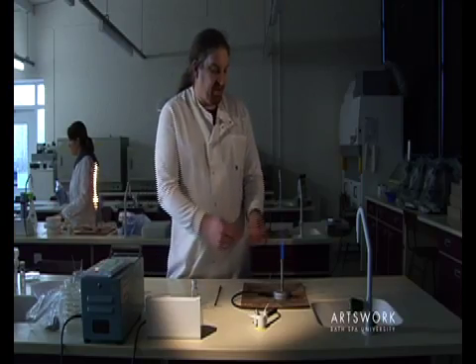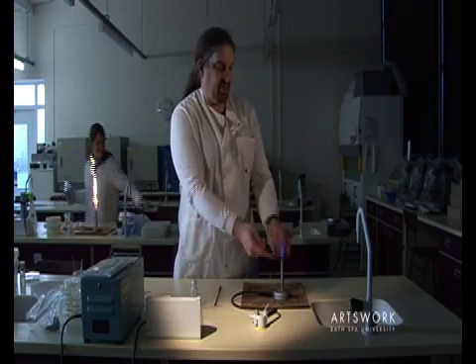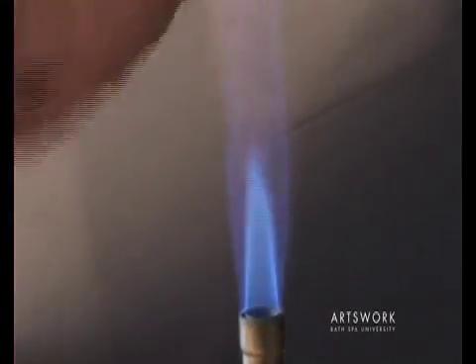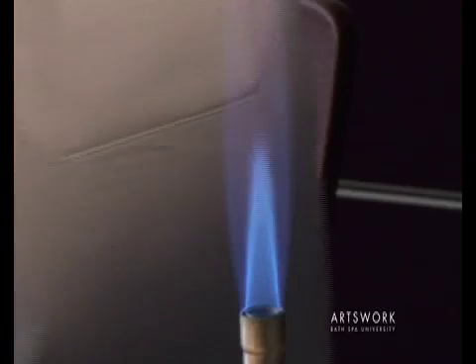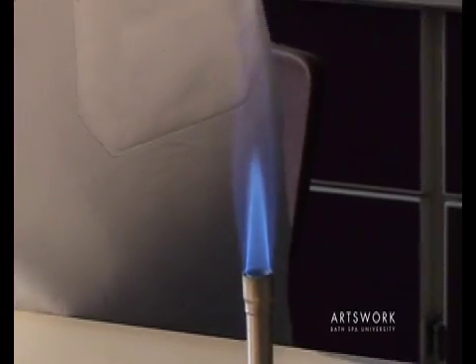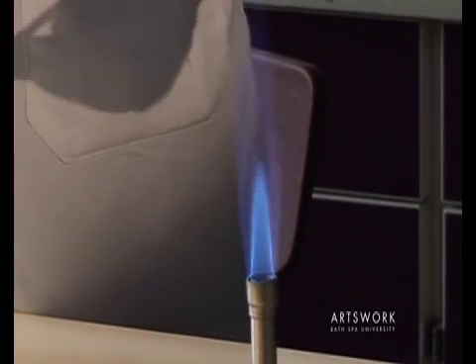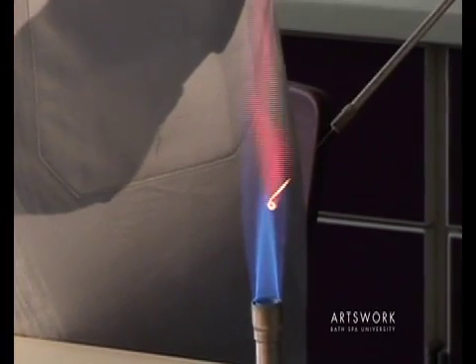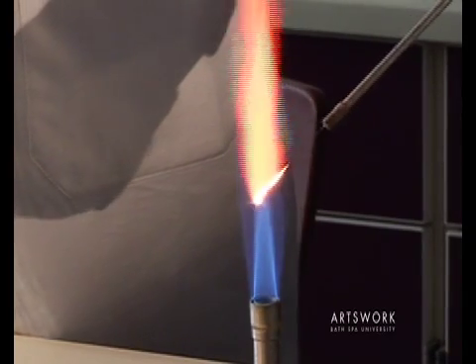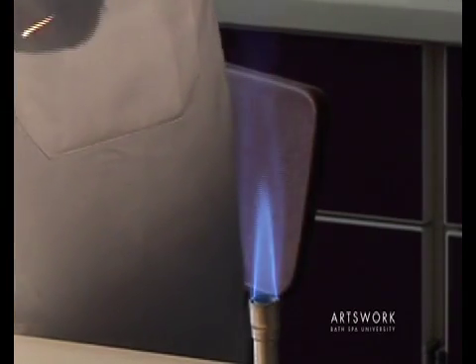If you notice the flame, you've got an outer cone of blue gas and a much smaller cone in the middle. The hottest part of that flame is at the peak of that inner cone. So if you're using the flame to sterilise equipment, put it directly into the top of that blue cone, and almost instantly you can see the metal loop has become red hot.